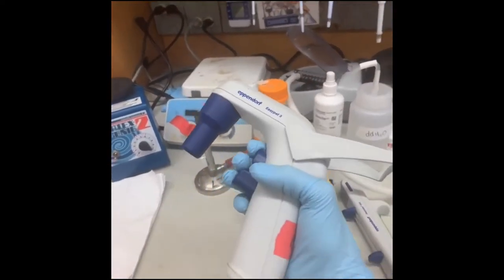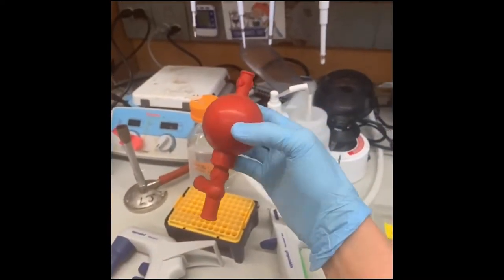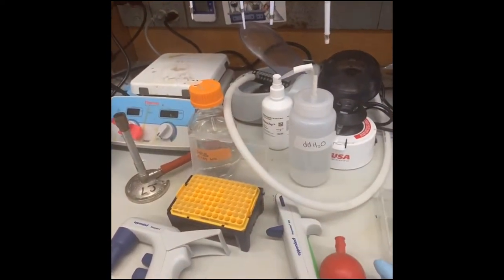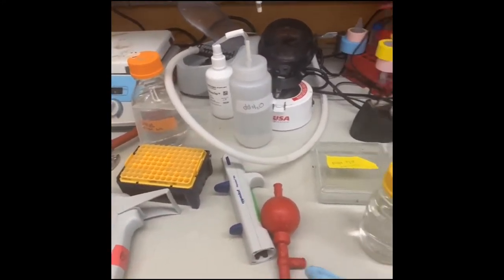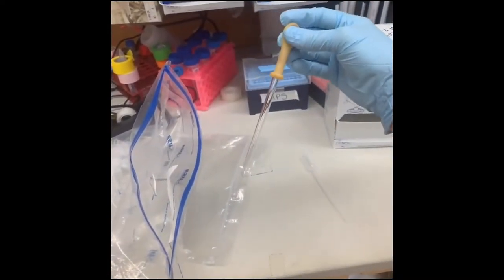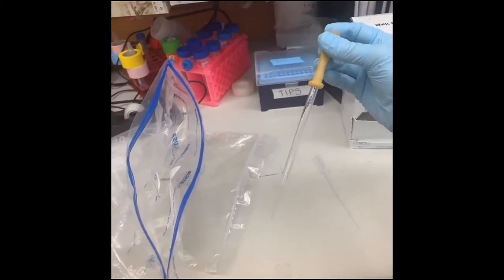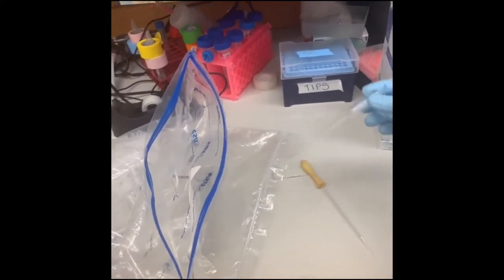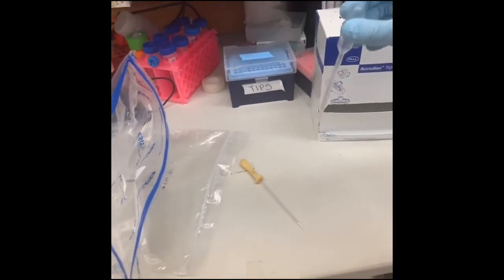This thing is super super helpful. It replaces bulby things and other types of bulby things that themselves replace mouth pipetting — which is literally what it sounds like. People would suck up liquid through pipettes, which is super dangerous and not a good thing to do. Other types of pipettes: you have Pasteur pipettes which are glass, used a lot for pH balancing small amounts of acid or base. And transfer pipettes, which are good for when you don't need to be exact but just want to squirt things from one place to another.